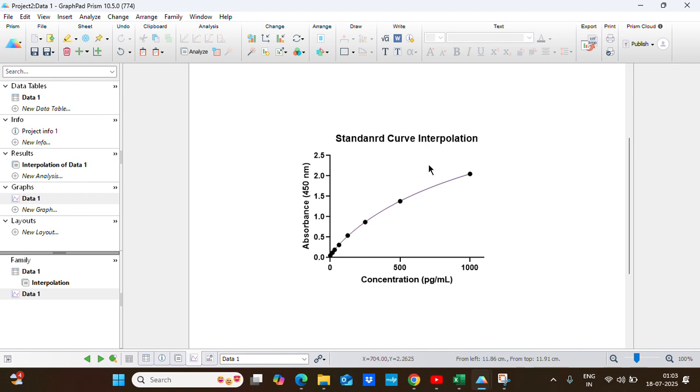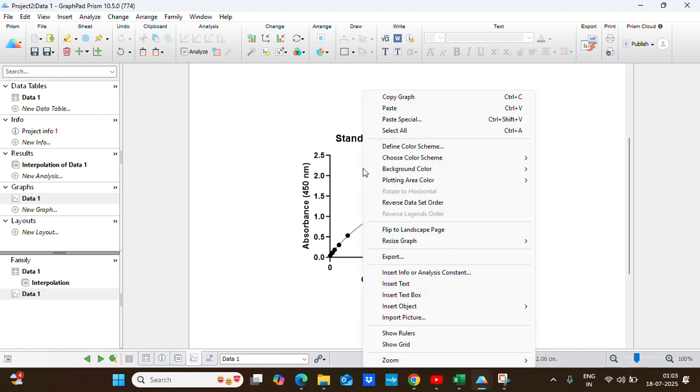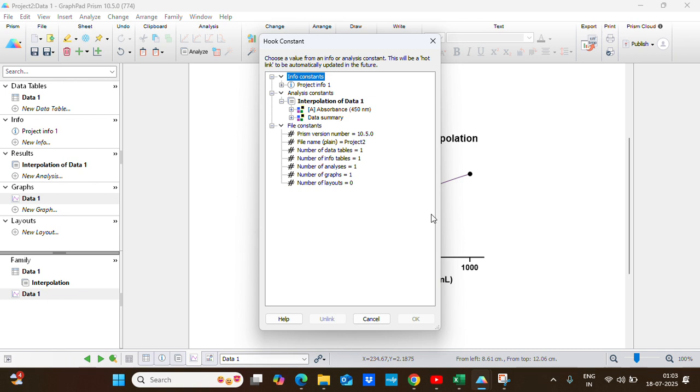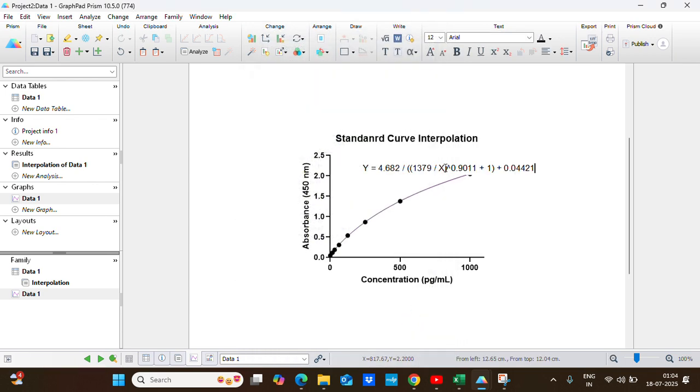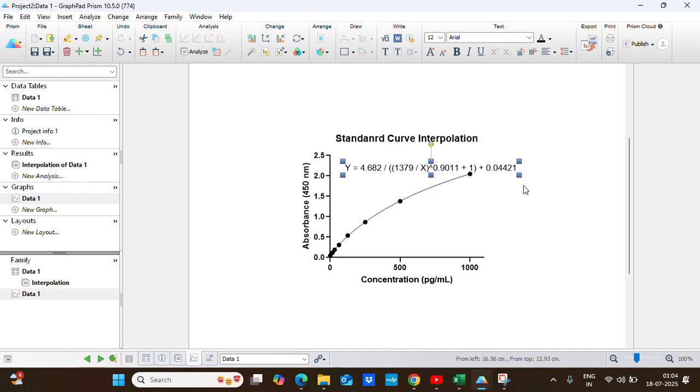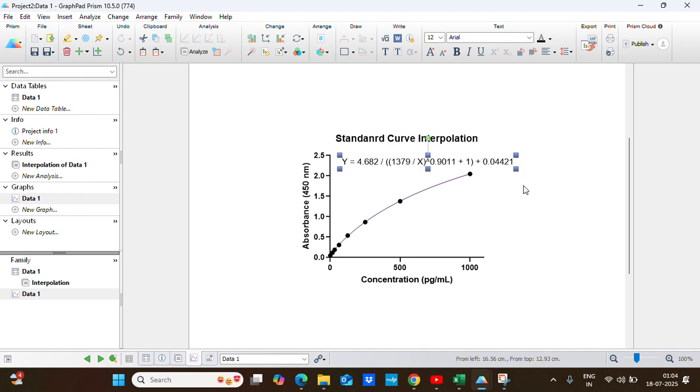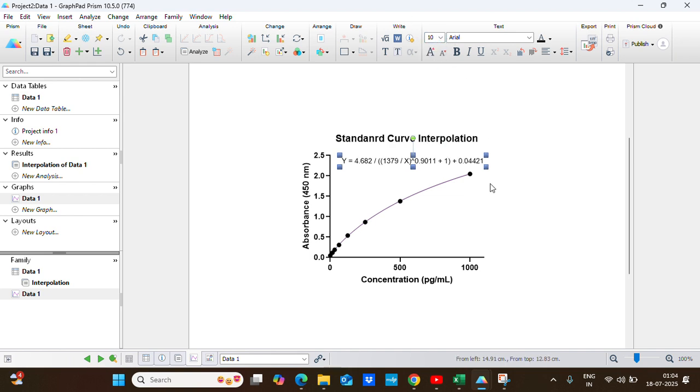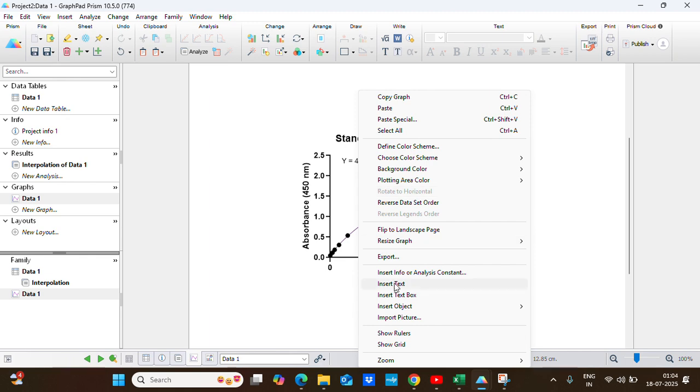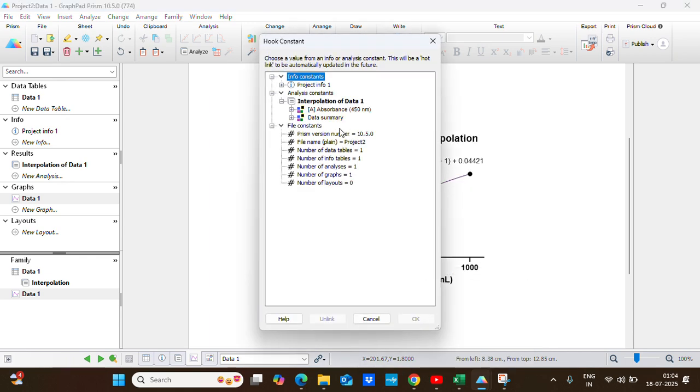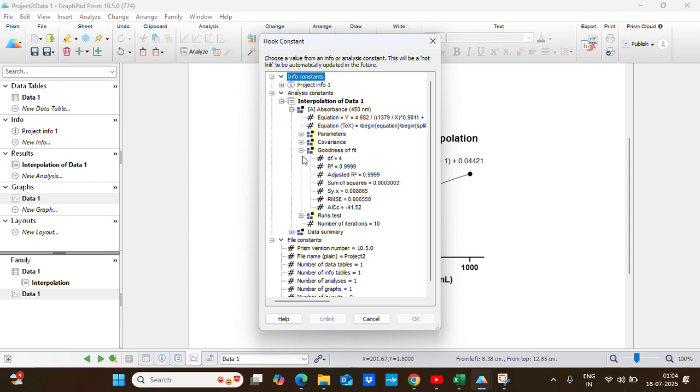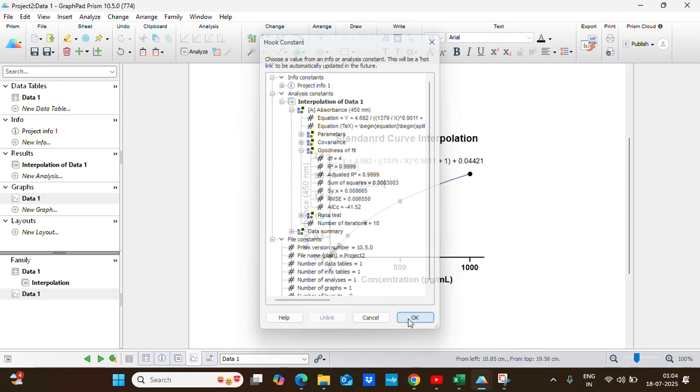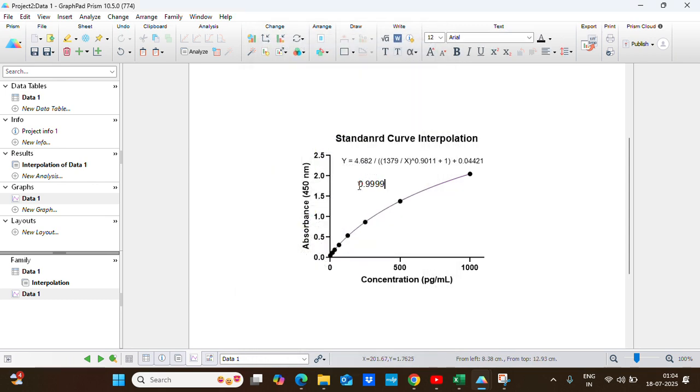Now I want to paste the standard curve equation and R squared value. What I will do is right click here and choose the option insert info or analysis constant. This will open up a new window where I will choose the equation. This is the equation for the model we used, that sigmoidal model. Then I will choose the R squared value.